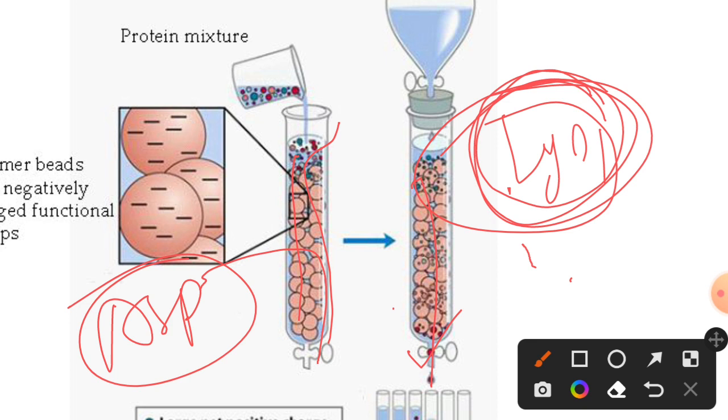Because lysine is a basic amino acid, that means it predominantly carries a positive charge. So we have to use negatively charged bound molecules. With the help of that, we are using negatively charged bound molecules in the synthetic resin, and we bind the positively charged lysine with the help of the buffer that we are using. I hope up to that point it is very clear to you.